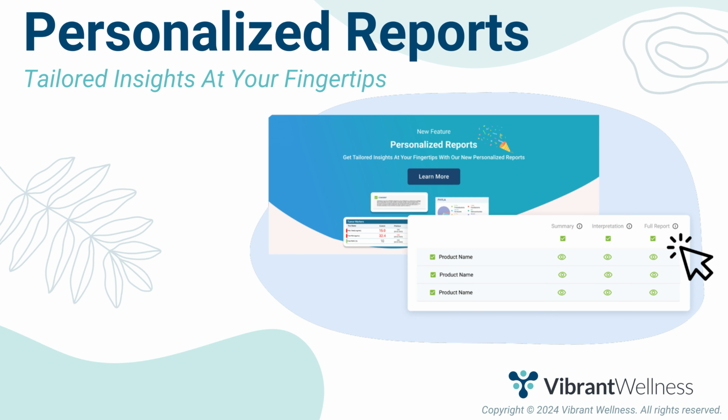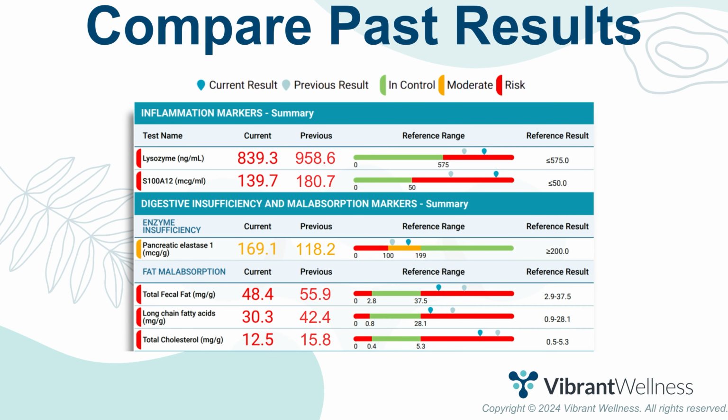If you always have the entire data set, you must first decide what's essential and mentally note it as you sort through pages of results. Relying on your memory to relay relevant information to the patient can lead to oversight errors and mental fatigue. This process is even further complicated if you're comparing current and previous results. We made this easier by automatically displaying past results on the same report.